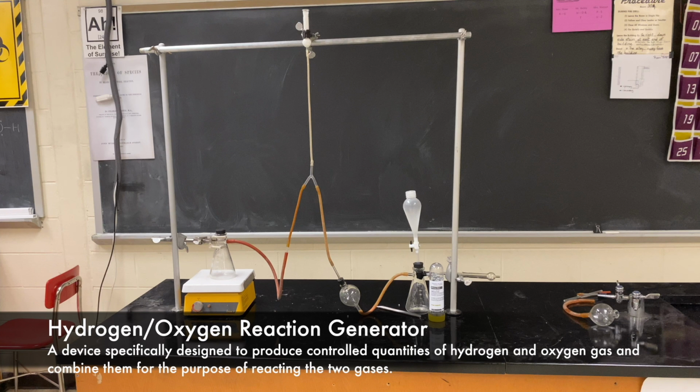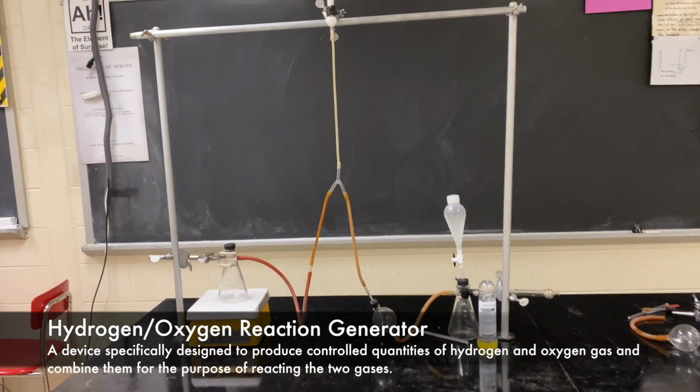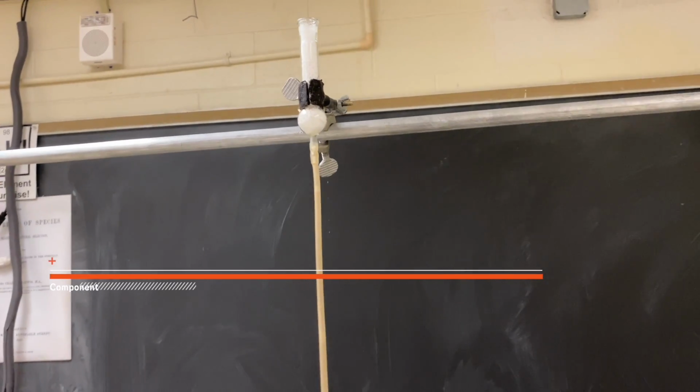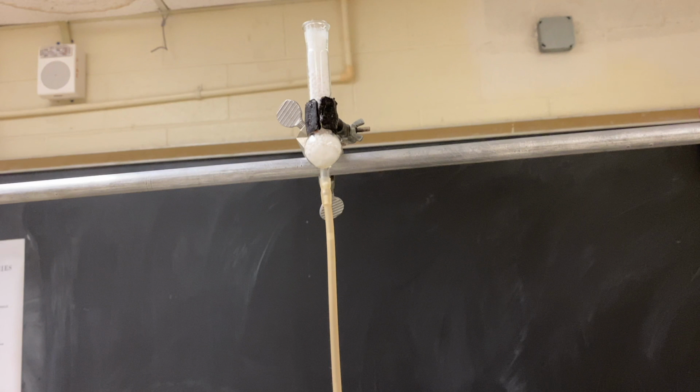Here we have the hydrogen-oxygen reaction generator that I designed. It's specifically designed to produce hydrogen and oxygen gas for the specific reaction between the two gases. The point at which the glove is attached is called the production outlet. It's a piece of glassware called a drying tube. It's filled with a drying agent to absorb any water vapor that's produced from the reaction that creates the hydrogen gas.